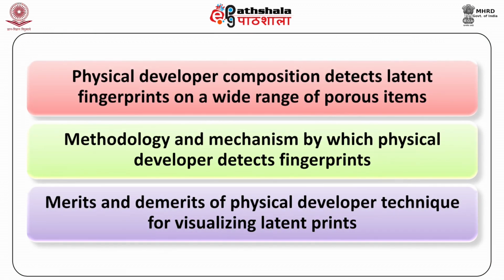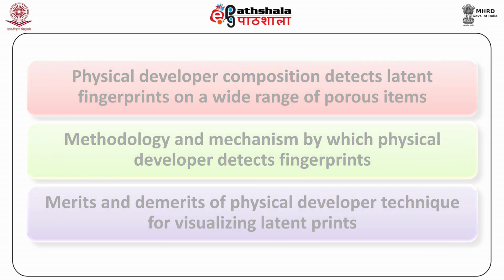Dear students, after studying this module, you will be able to know that physical developer composition detects latent fingerprints on a wide range of porous items, the methodology and mechanism by which physical developer detects fingerprints, and lastly, you'll learn the merits and demerits of physical developer technique of visualizing latent fingerprints.